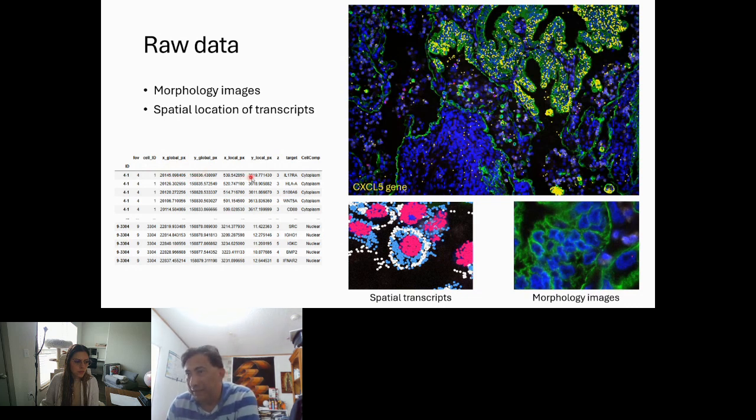That corresponds to the complete data set. However, this data came in different, what we call fields of view. They are small pieces, right? They divide the image into smaller pieces, so we also have a coordinate that corresponds to that FOV. The idea is that for every transcript on the bottom left image, for every dot that is a transcript, we will have coordinates. And because it's a plane, we have an X and a Y coordinate that identifies the position of the transcript.